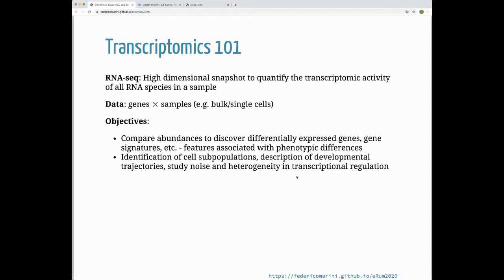Single cells make this a little more complex because it adds the very nice cell type, single cell resolution. And in brief, there are a wide variety of applications that exist for these data types. Sometimes they are just based on a slightly different point of view, or even exploiting the very same data, but say one of the main workflows to focus on is differential expression.